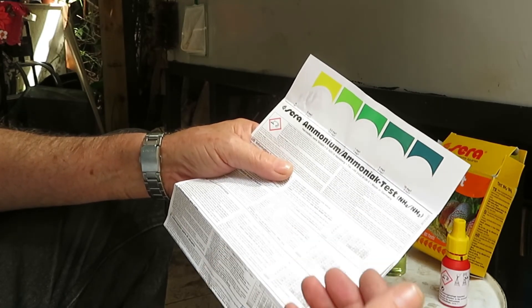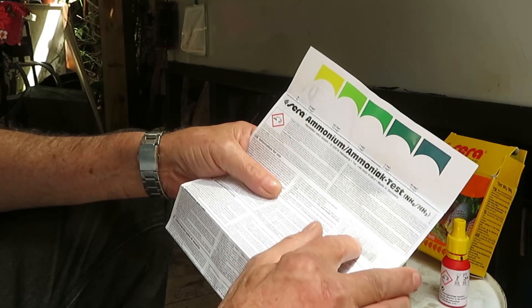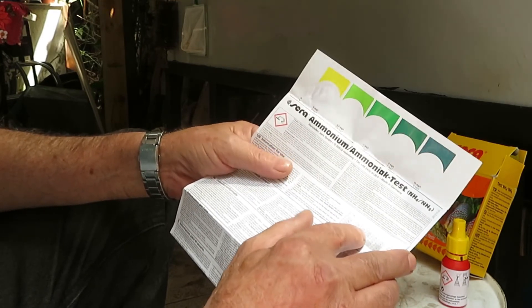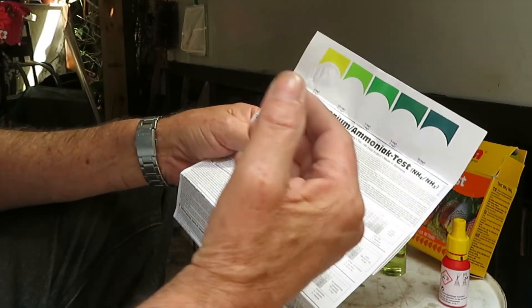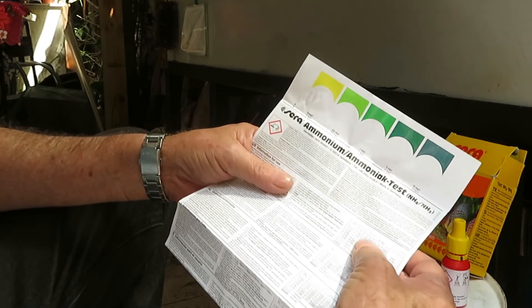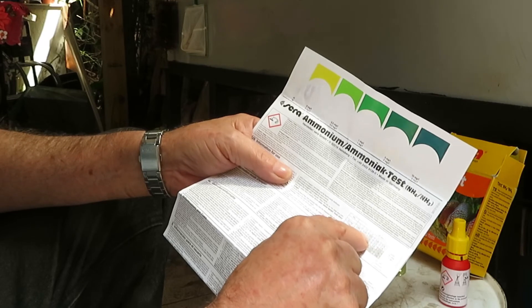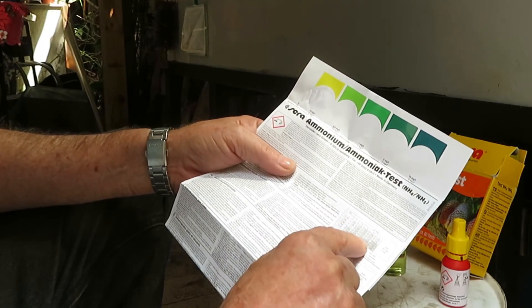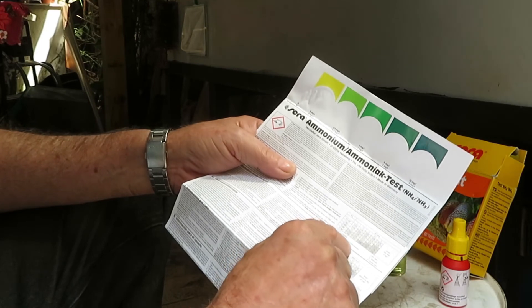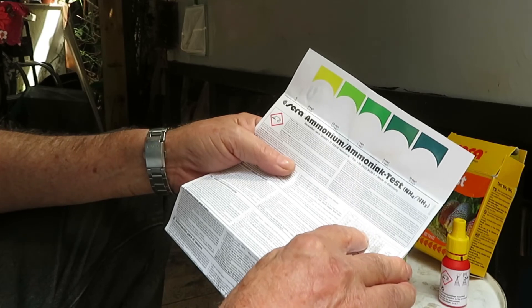We can consider that the aquarium is in good condition for the time being. However, the pH has been rising in the last few days, so we must be careful — if it reaches a pH of 8, the ammonia level would go from harmless to harmful if animals are kept in there for a long time.